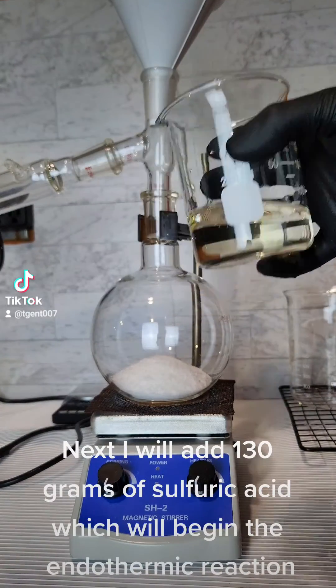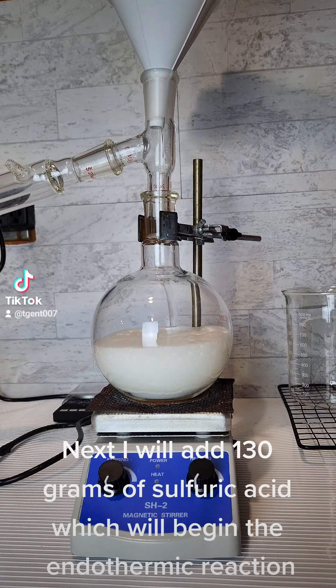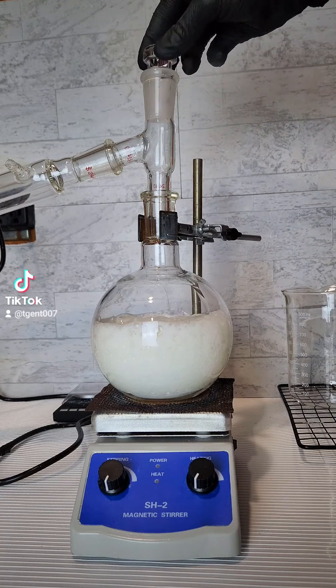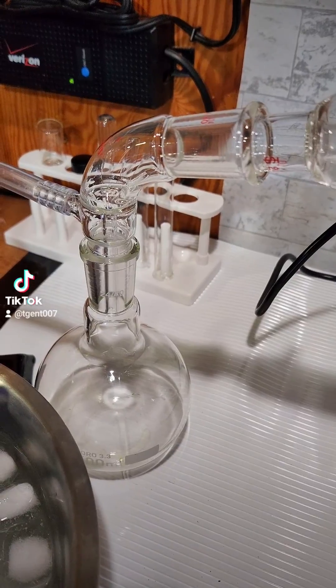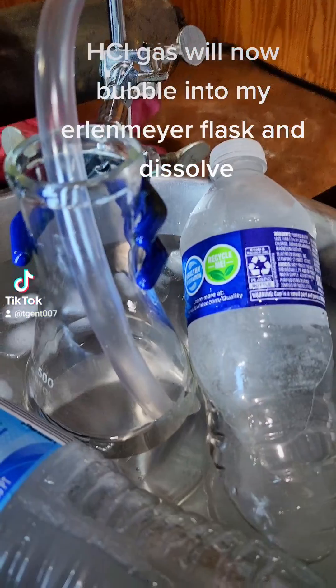Next, I will add 130 grams of sulfuric acid, which will begin the endothermic reaction. Cup it and apply heat. HCl gas will now bubble into my Erlenmeyer flask and dissolve.